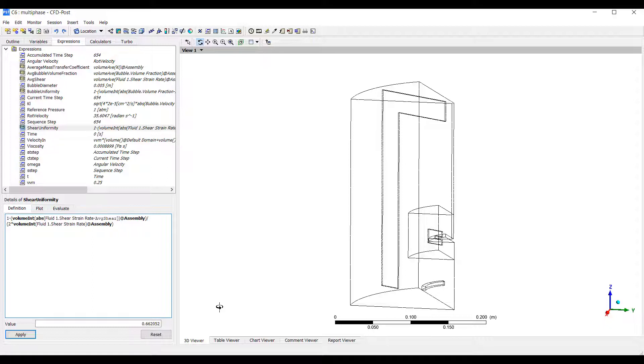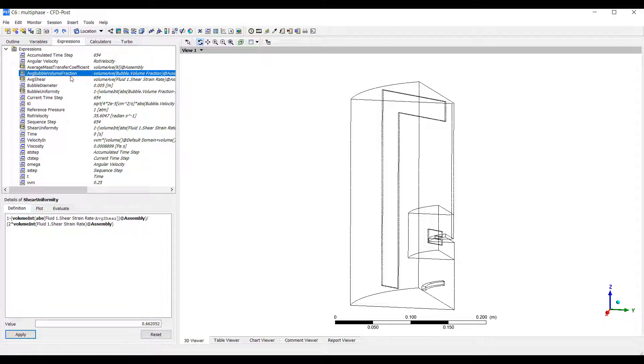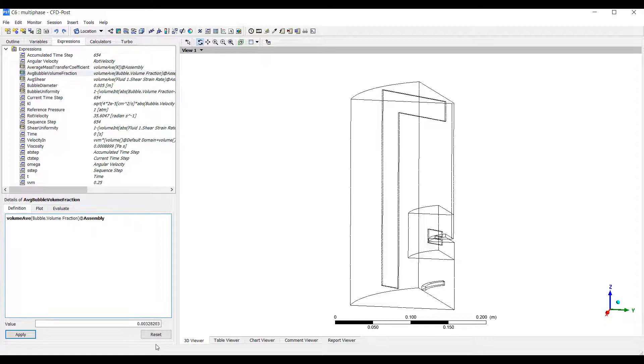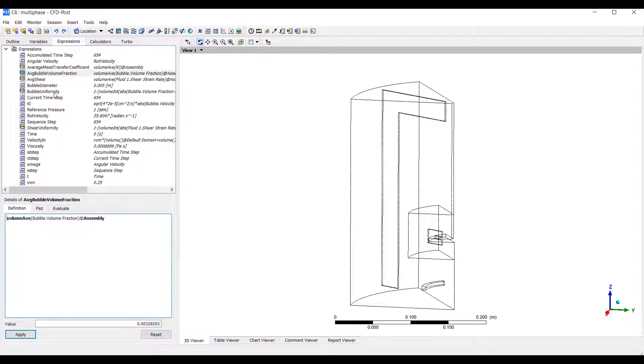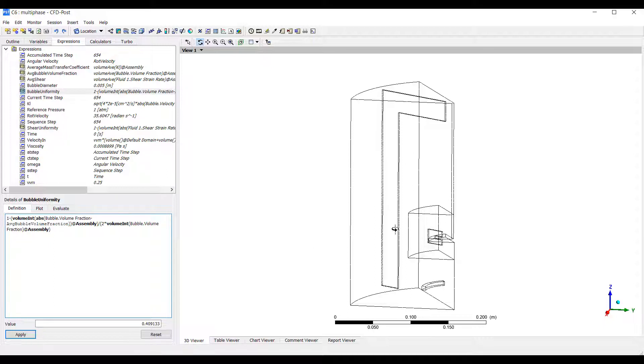We can also use this to calculate things like the volume in which shear exceeds a certain value. I use the same type of expression to calculate the average volume fraction of the bubbles and then the bubble uniformity. On average, the volume fraction of the air is 0.003, so that's 0.3%. If we look at the bubble uniformity, we have a value of 0.4, so it's not very uniform. There's only a little bit of gas in our domain.